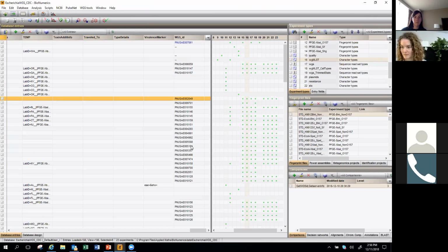So are we talking about cluster detection or are we just talking about naming? It runs pretty efficiently in terms of cluster detection. It basically scans the whole database and pulls up clusters based on your defined thresholds in that settings view. In terms of the names growing, we base the names on a tree that's been built with everything we have already in existence for the nomenclature, so for all the stuff that we've sequenced over the years. And it seems to be pretty scalable. I don't know if Heather, you have more to add about how the nomenclature is built on the tree.